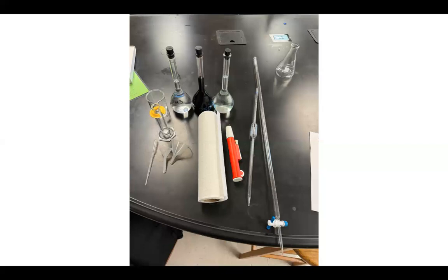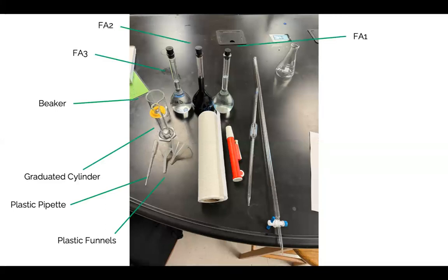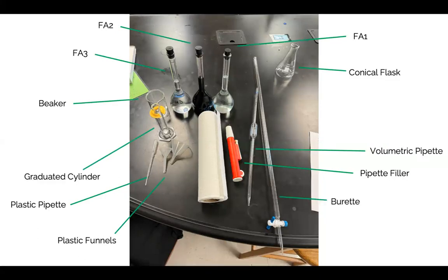Again, here the materials are just laid out. So these are plastic funnels, a plastic pipette, graduated cylinder, beaker, and the 3 materials, FA3, 2, and 1. On the day of the exam, these are always given in beakers rather than volumetric flasks, so just note that, and they're always going to be labeled. The conical flask, volumetric pipette and pipette filler, the burette, and then finally paper towels. Paper towels, though they're not listed, are always great to have in any experiment in chemistry.